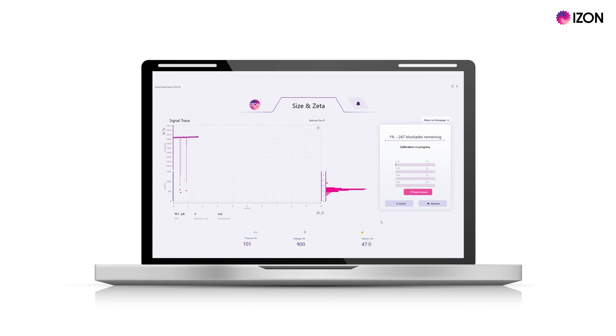The software will now run the calibration for zeta measuring at your set voltage both with and without pressure applied, then at 80% and 60% of your set voltage at zero pressure. This allows the system to distinguish the impact of the electroosmotic forces from the electrophoretic forces.